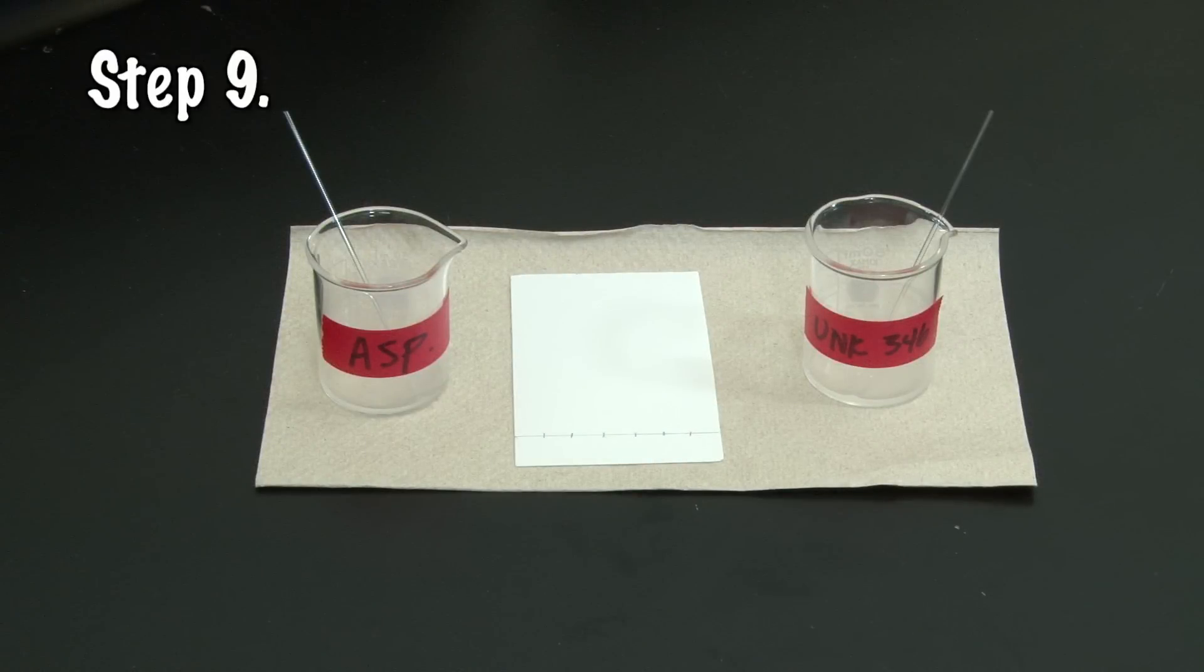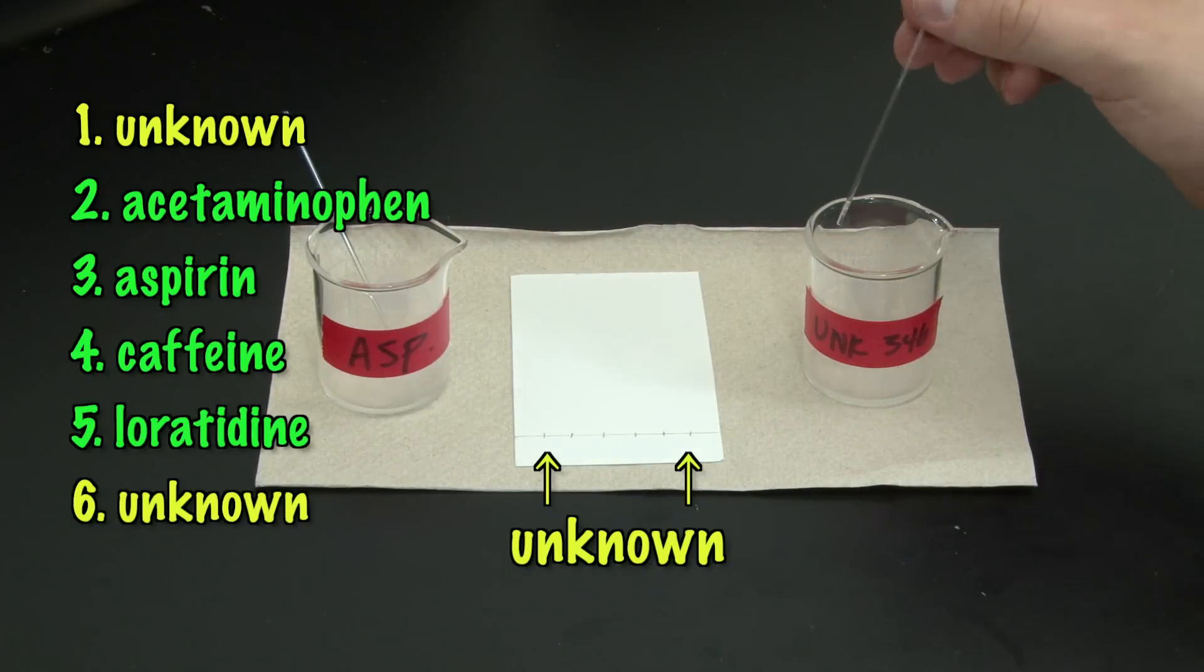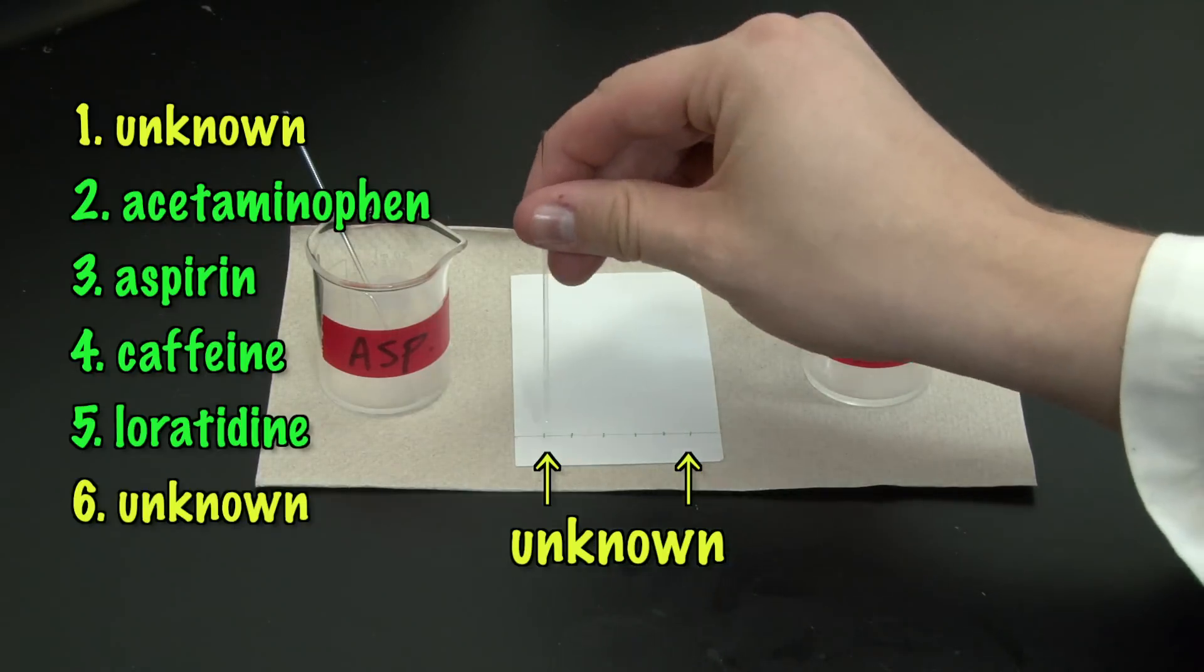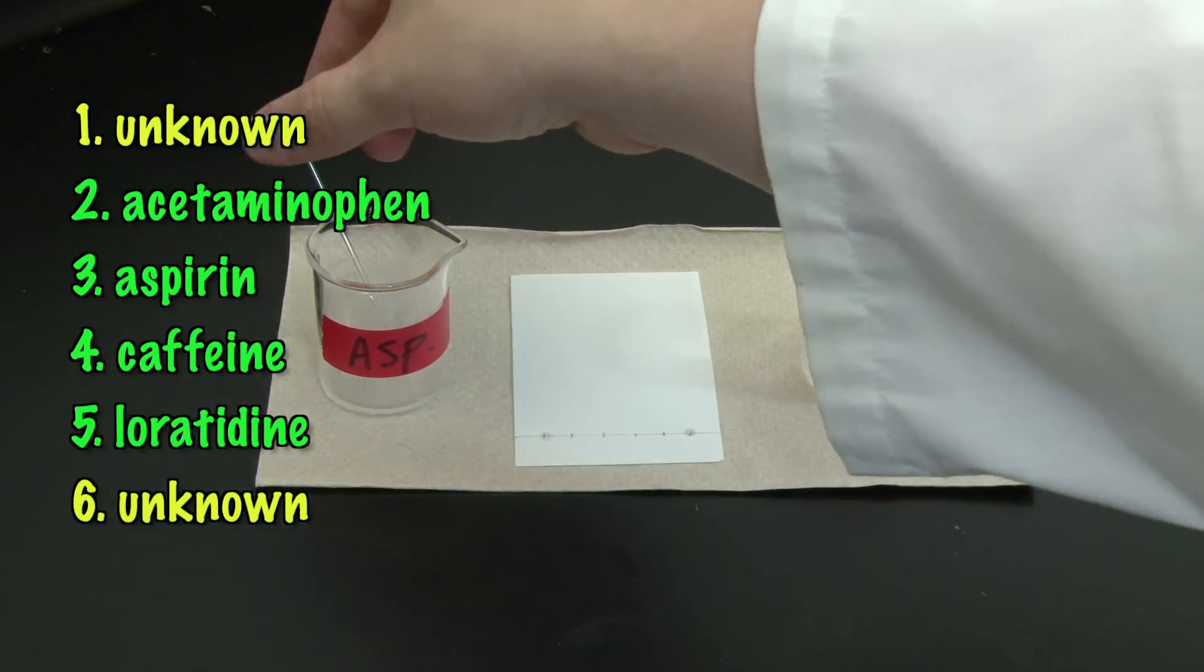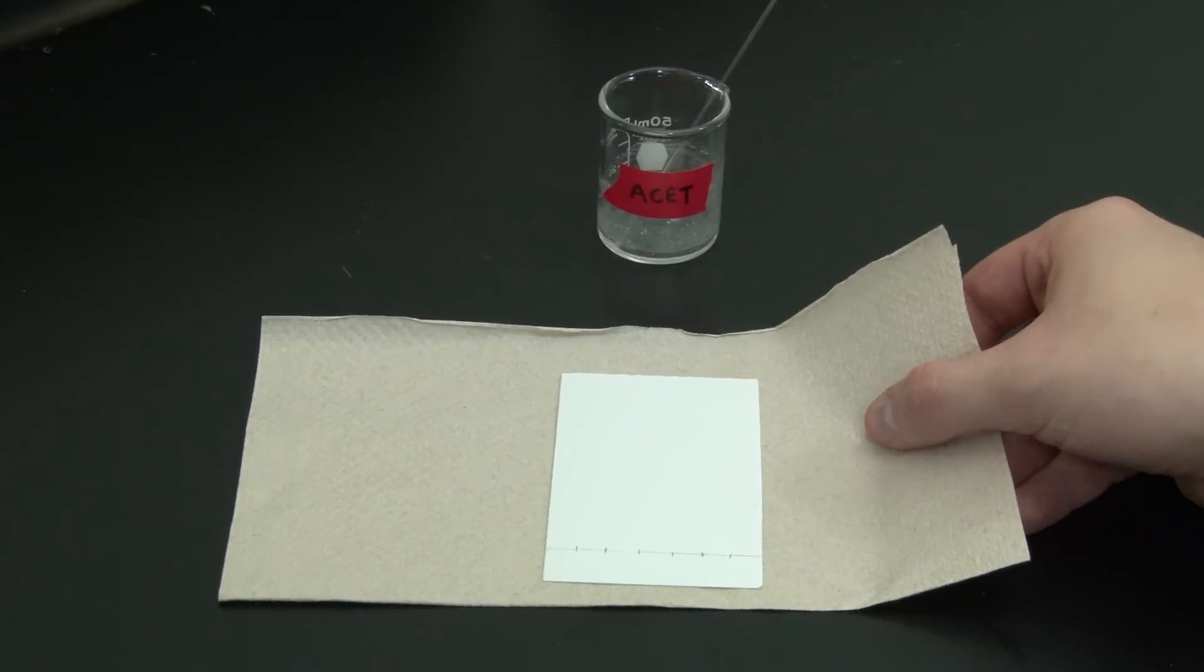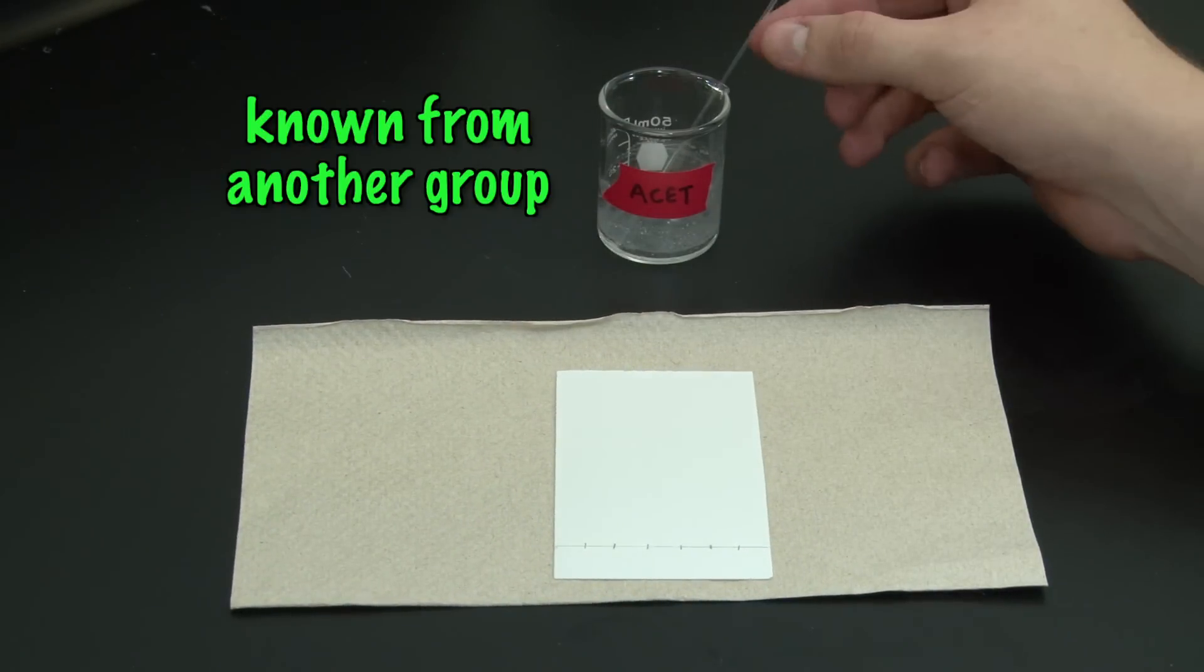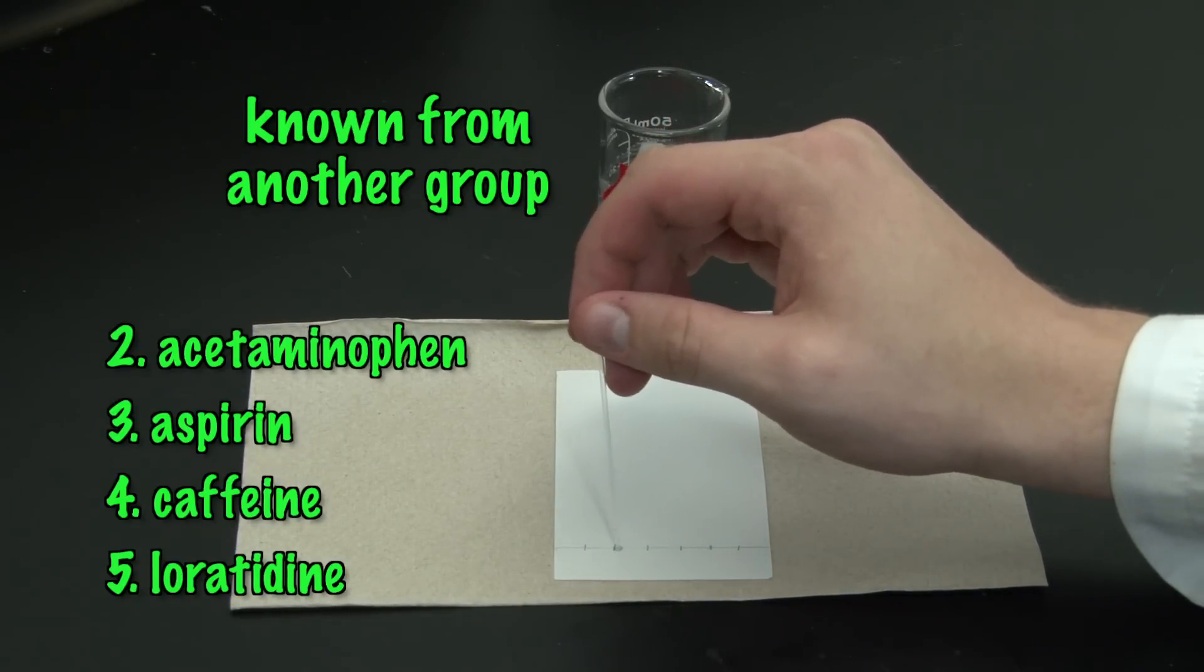Now, apply the known and unknown drug samples to your TLC sheet in this order. Your unknown will be in the outermost positions, 1 and 6, and the known samples that you and your classmates prepared will be in the inner positions, 2 through 5. This way, your unknown is spotted on both sides of the knowns you're comparing it to. Spot your unknown in positions 1 and 6, and spot the known that you prepared in its correct position. Then, take your TLC sheet around the room, using the known samples that other groups prepared, until you have all the samples spotted on your TLC sheet in their correct positions.